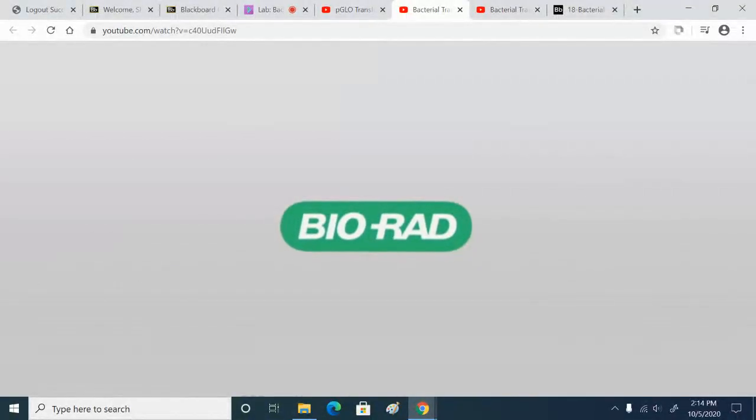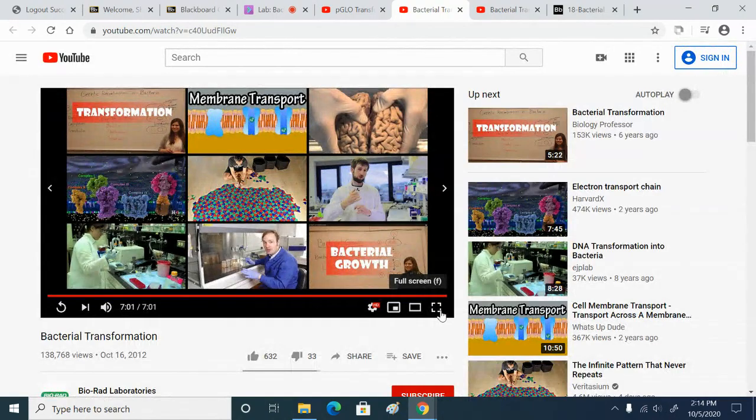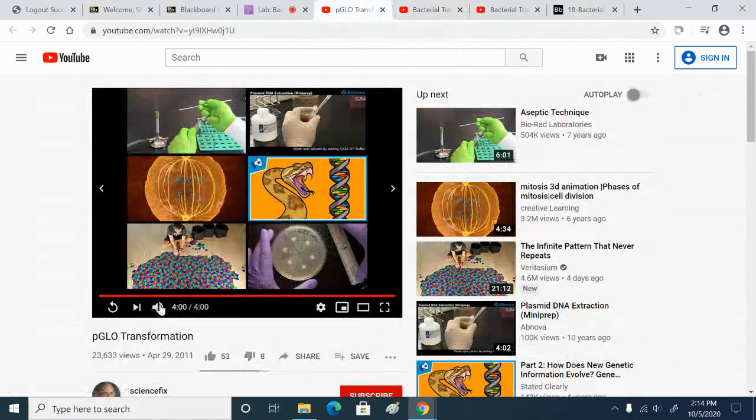And they're using those cute little mini agar plates. We use the full-size agar plates, so it really helps to use a spreader rather than a loop to spread everything around. And in the last video, we'll see some actual results. There's no sound on this video.